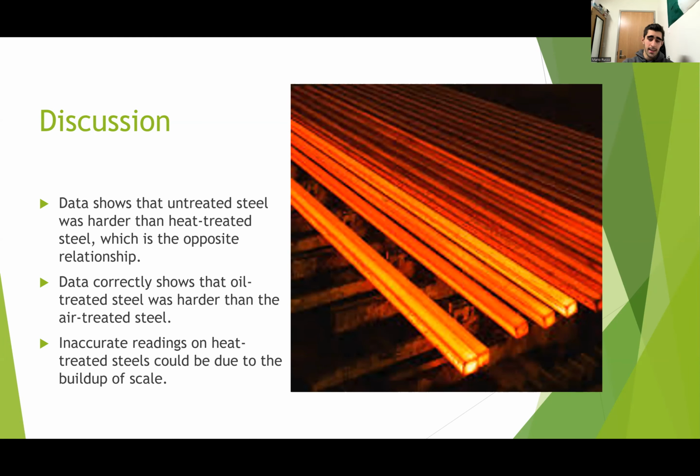So the data we collected is actually the hardness of puncturing that first flaky shell instead of the actual hardness of the steel itself. We would have removed all of the buildup individually and then properly tested it. However, there wasn't enough time in the lab to actually fully clean the samples and then retest them. So the data we have is what we have, and it's sadly inaccurate.